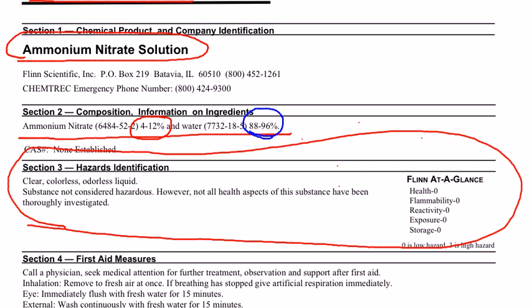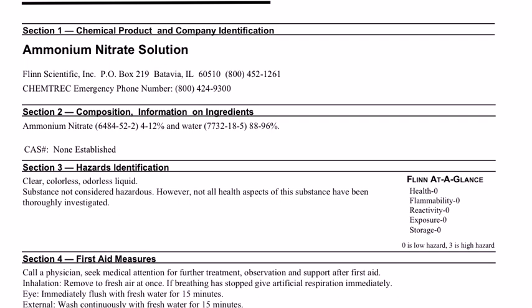Over here on the right, you'll see an area that tells you 'Flynn at a glance.' Most chemicals have this printed right on the bottle, where a 0 means very low hazard — not no hazard, because no chemical is completely hazard-free — and a 3 is very high hazard. I mentioned in the introduction that ammonium nitrate is a pretty dangerous solution, but this at-a-glance rating tells you it's not.